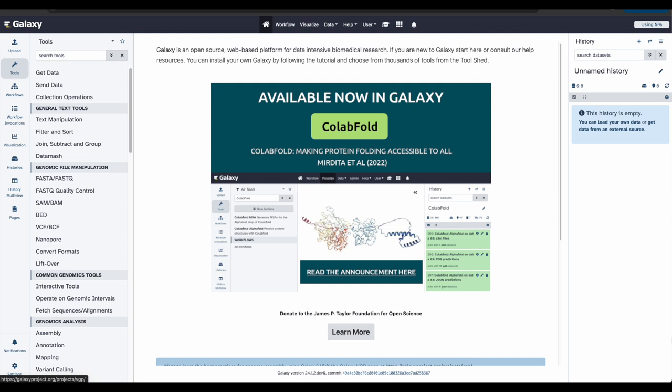This tutorial aims to help familiarize you with the Galaxy user interface. It will teach you how to perform basic tasks, such as importing data, running tools, working with histories, and creating workflows.